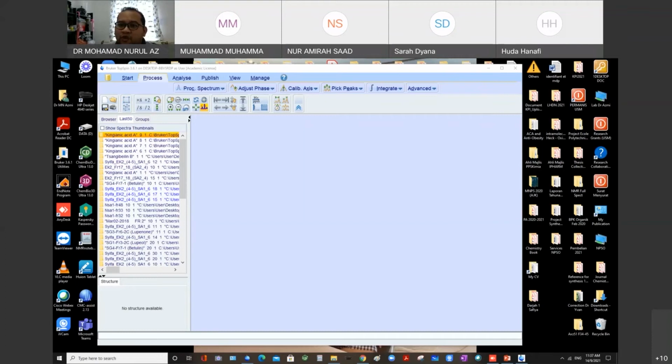To make you familiar with this kind of Bruker software, Topspin, make sure you have your own NMR spectra and train. Like Shahira's work, sometimes I know that you synthesize the simple compound in the beginning, but when you start to do coupling of chlorine with the amine groups, you need HMBC because you need to know which chlorine they will couple with, since you have different substitutions on the benzene ring in quinazoline, Shahira and also Laksani.